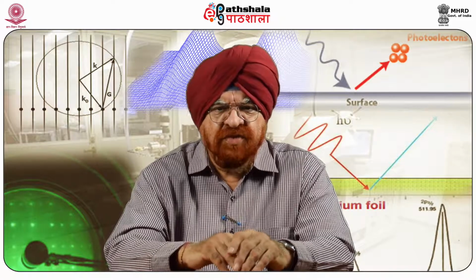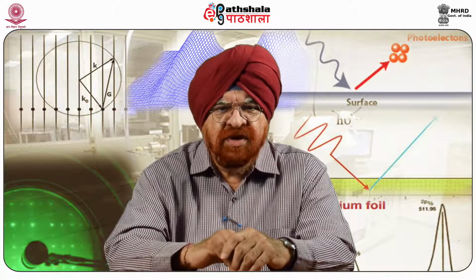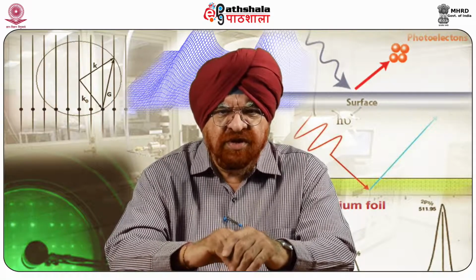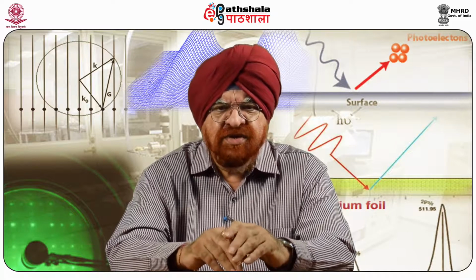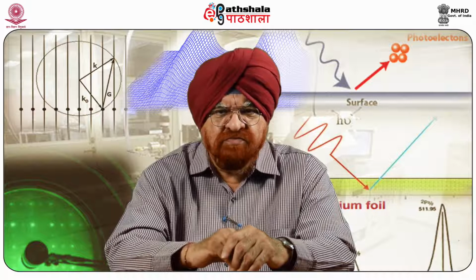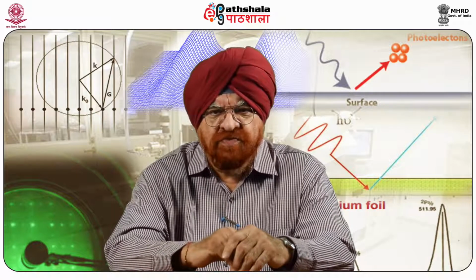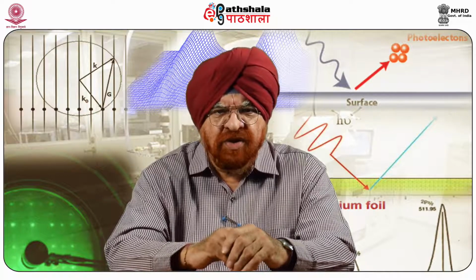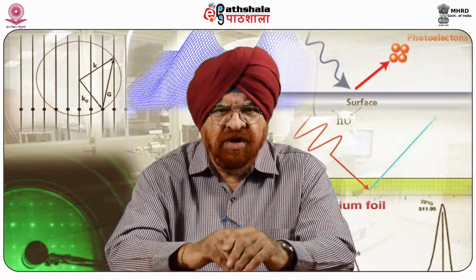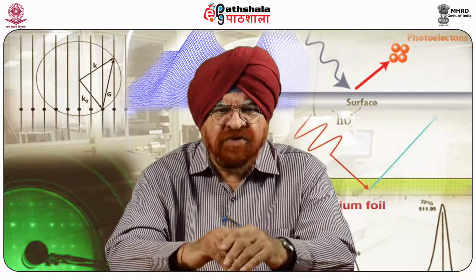Various studies have been performed to directly visualize the magnetic domains and their dynamics in different materials using techniques such as the magneto-optical Kerr microscope called MOKE, Lorentz electron microscope, scanning electron microscope with polarization analysis, neutron grating interferometry technique, and magnetic force microscopy.